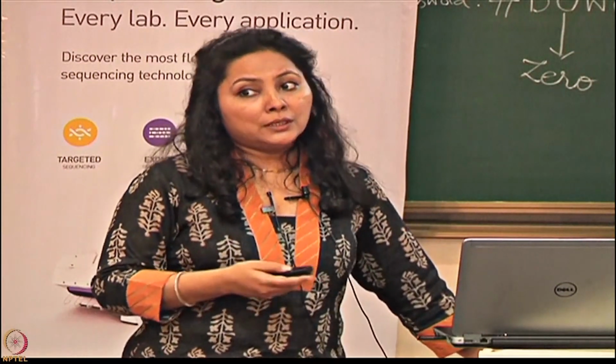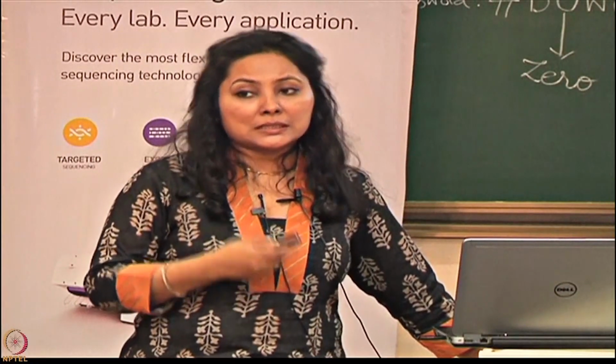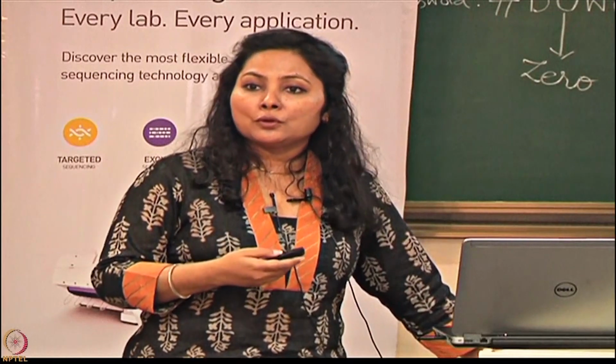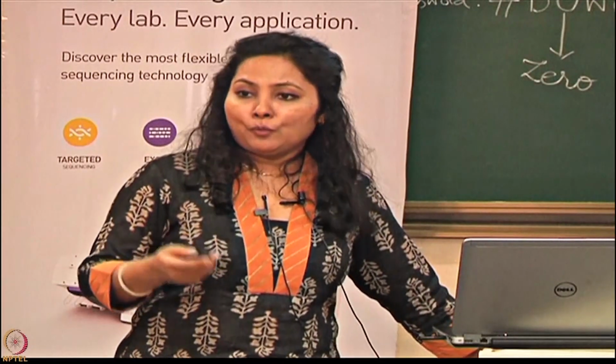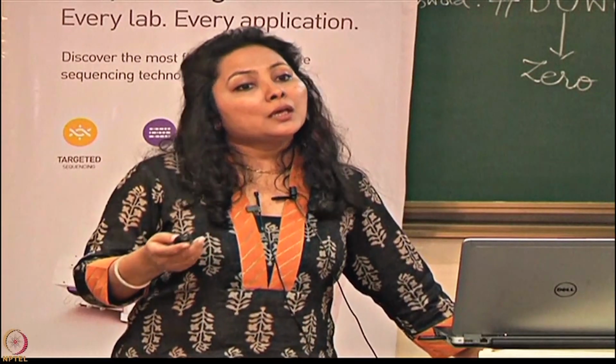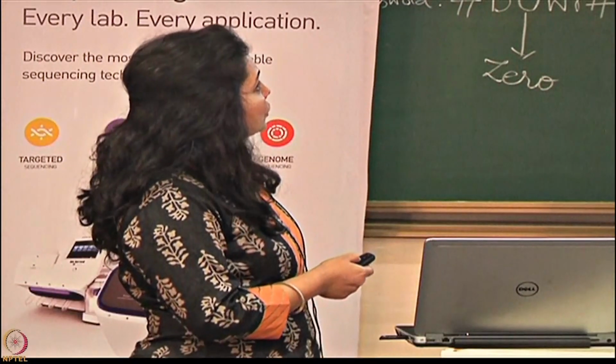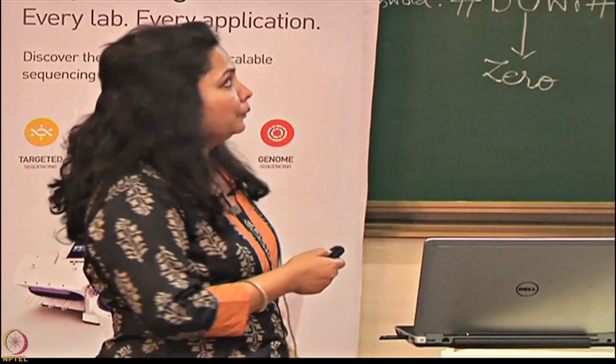So once you have loaded, you initialize your sequencer, which we discussed is going to take only 15 minutes, and then your sequencing run goes for anywhere from 2.5 to 4.5 hours depending on the kind of read length you are targeting.